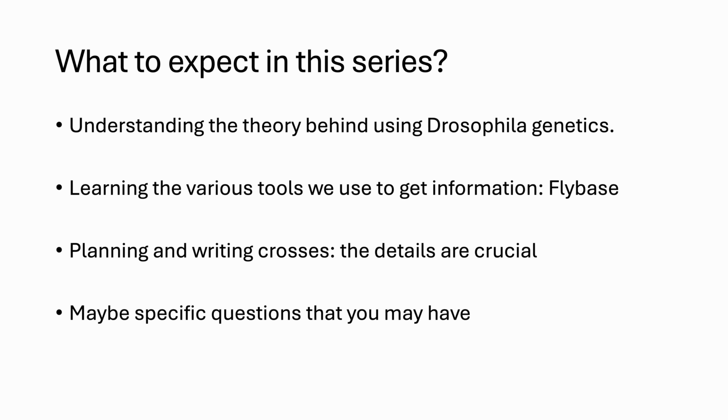So in this series, I think you can expect to understand the theory behind using Drosophila genetics, meaning what is the makeup, how can you actually introduce new genes, how can you take away genes, how can you knock down genes, take away their function.